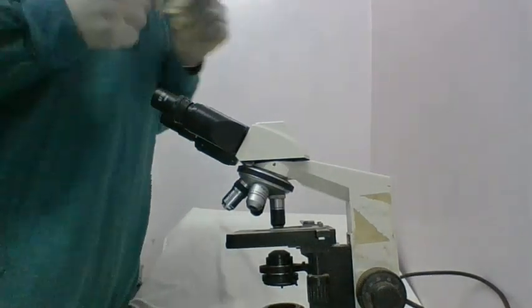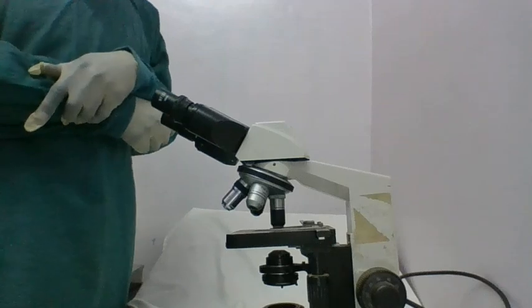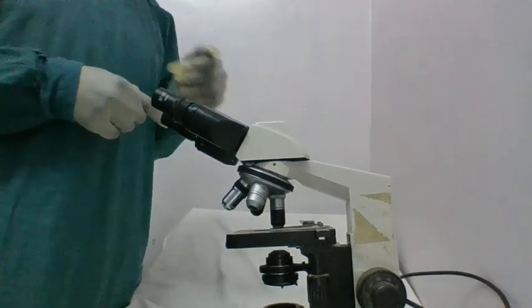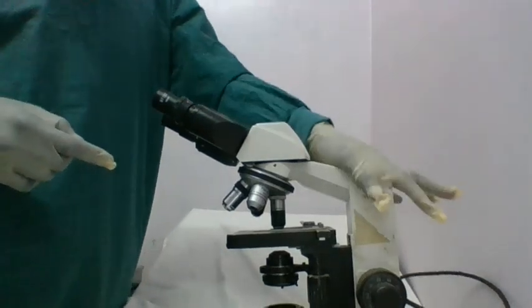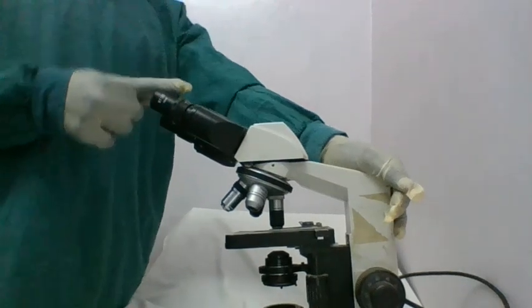You are a maintenance officer, a biomed, and you are giving the medical lab a hard time using the equipment. And guys, as the user, the medical lab personnel, you also make sure that the microscope is always being maintained very well, because you're the one using it.